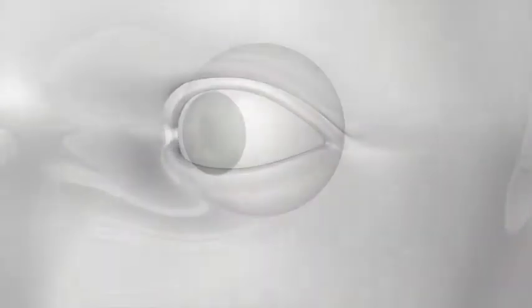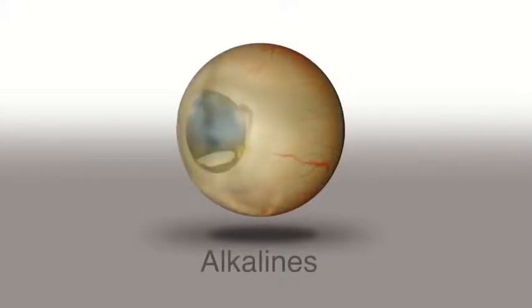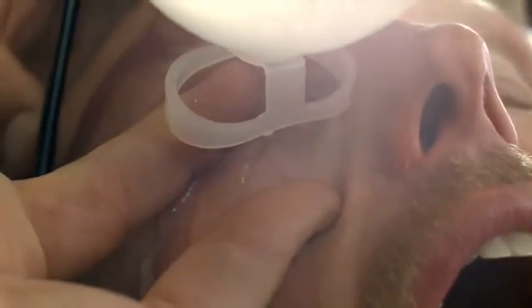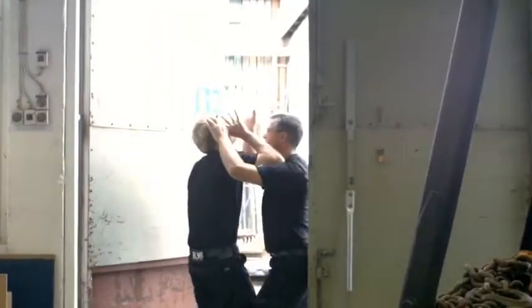Alkalines. This is the most severe type of eye injury, caused by alkaline substances like lye, cement, and ammonia. Reaction time is even shorter than acids, eating into the soft eye in about 3 seconds. Ammonia has been known to reach the inner eye in just 25 seconds, and permanent eye damage is common. But if rinsing starts within seconds of exposure, it might be possible to limit the damage. The eye should be rinsed continuously for at least 25 minutes, while the patient is rushed to a doctor. Only a doctor can determine when you stop rinsing.